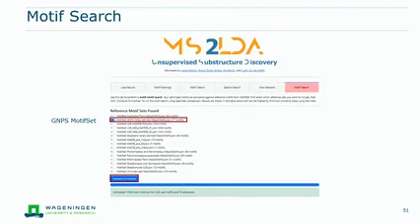Let's move on to the last step, which is called motif search. And that's also a really interesting one. Actually, there I will address something in a second where you can help us. The motif search has the goal to use the knowledge acquired from the users. And that was normally done with MotifDB. We still have MotifDB. It's a little bit different format now, but I think no one was exposed to it anyway. And here are all the motif sets that were manually annotated a long time ago, maybe 7 years ago.